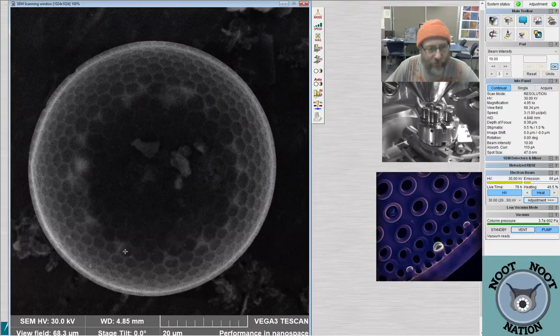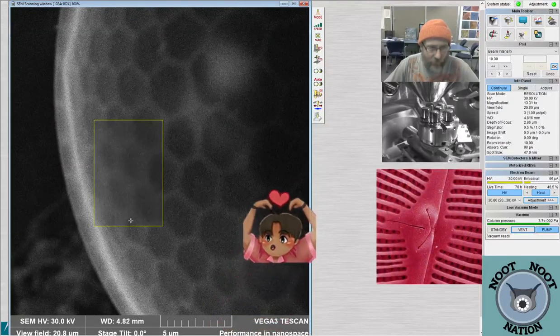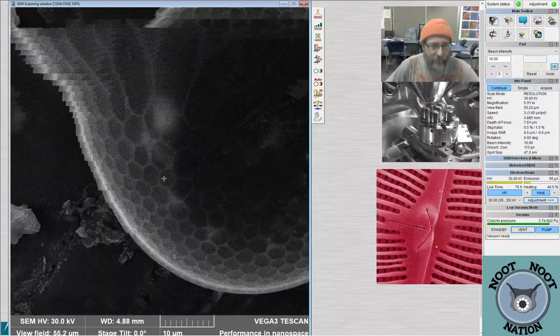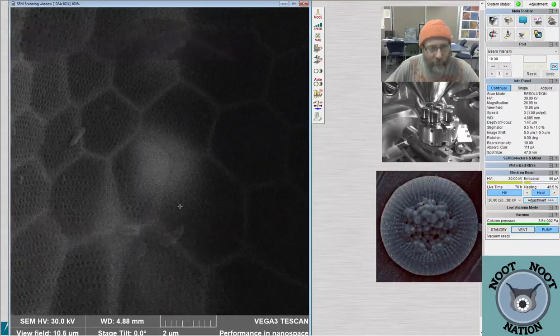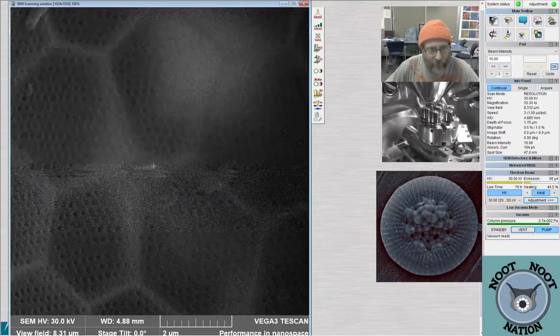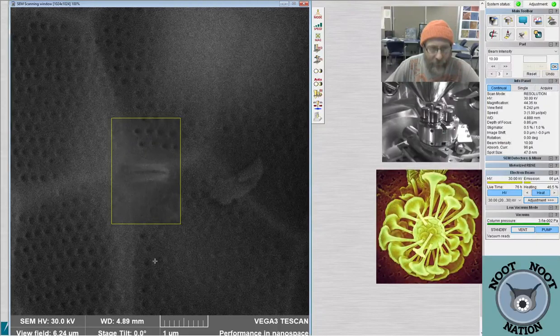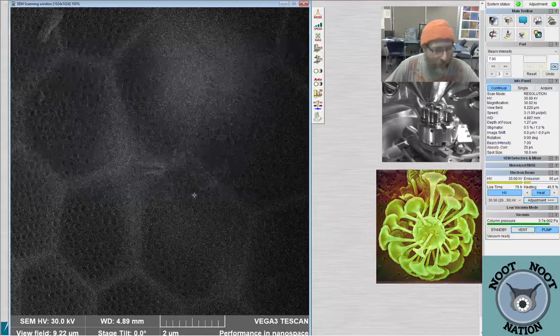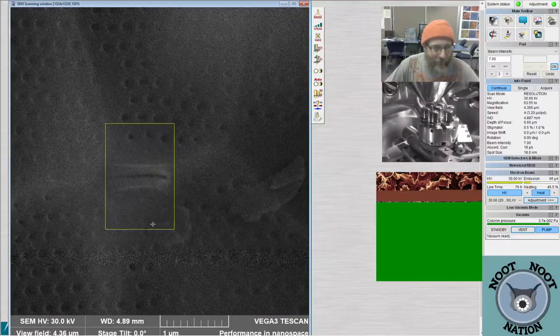Oh. It's the inside of a Stephanopyxis. Ooh. Huh. Here you go. Now it really looks like Disney's Epcot Center. And here's where the spines are. And now's our chance to figure out if they're actually Rimaportula. Oh. That's the Rimaportula right there. Oh, wow. And, oh, we're on beam intensity 10, that's why. It's like, why does it look crappy? Always the same reason. Beam intensity is usually the reason.